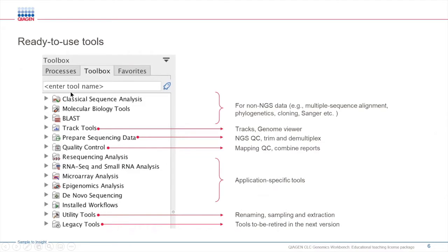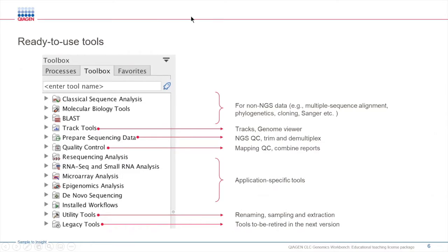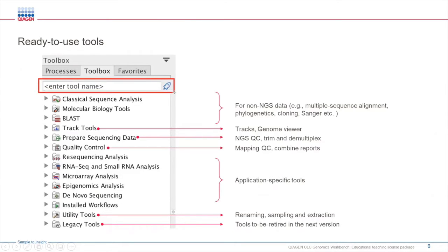When you open up the Workbench, you are going to see an organization of folders like this, which makes finding tools for specific applications easy to do. You can also utilize the search bar located on the top to search for specific tools of interest that you may not know where exactly in which of the tools it's found.